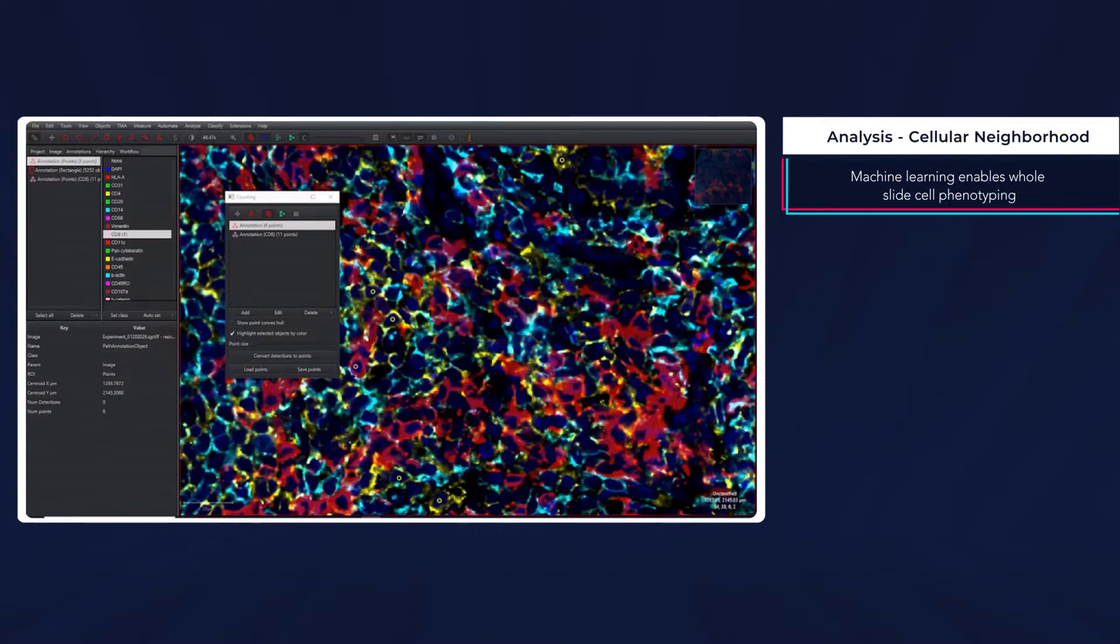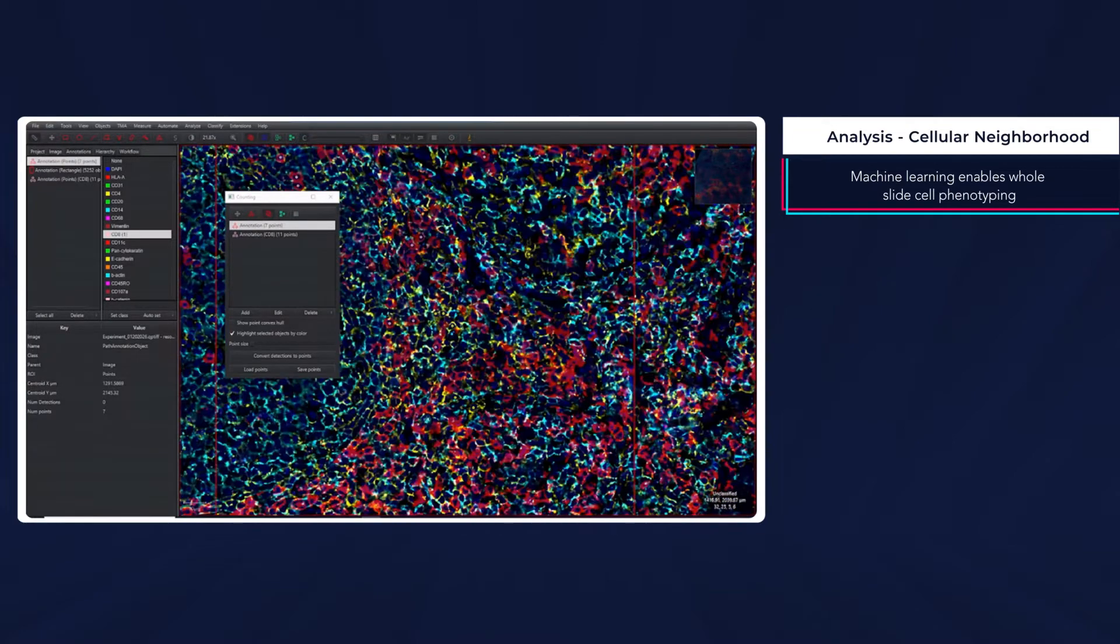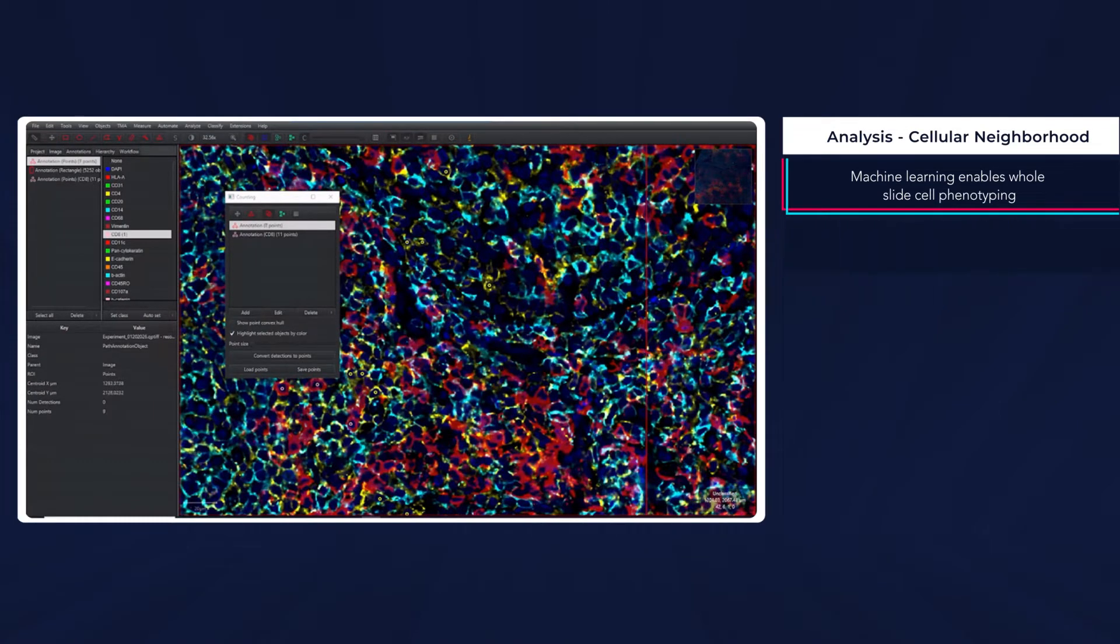Morphology and biomarker expression data can be cumbersome. However, cell classification and clustering algorithms can be leveraged to identify cell populations of interest, expediting hypothesis-driven experiments.